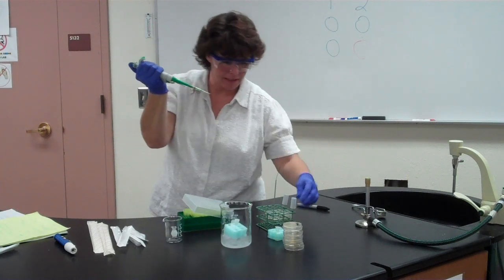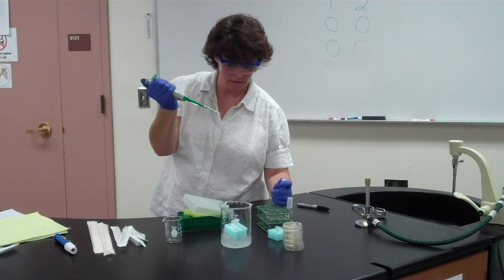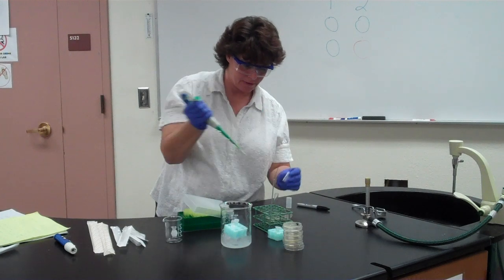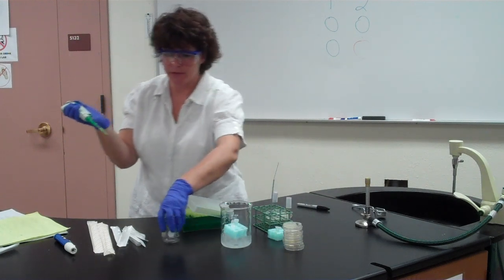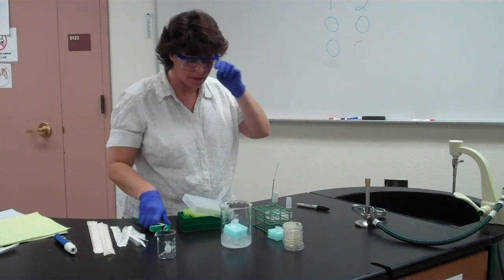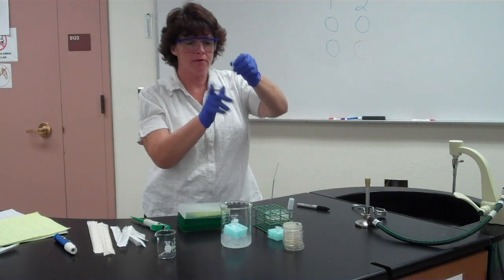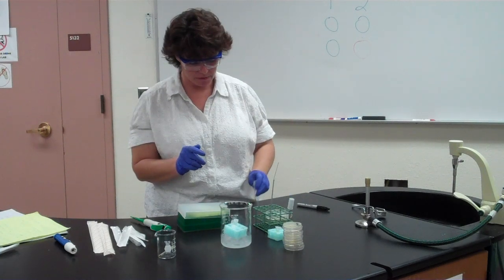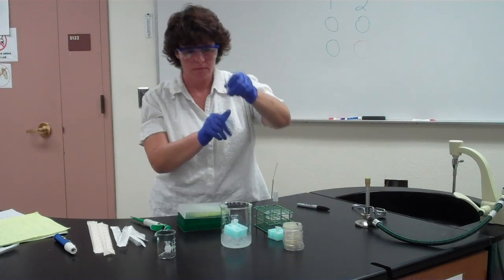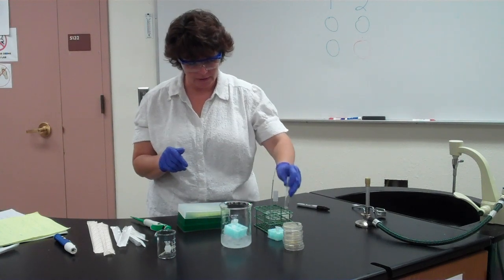So now we're going to put that into only the tube that says DNA positive. Now you want to make sure you get it down in there. Then we're going to put this in a waste container because now there's possibility of it having bacteria on it. You do not put the plasmid in the one that says DNA negative. The other thing that you want to do is make sure you tap those and make sure everything gets mixed. Okay, if you have stuff up on the sides, it's not going to react.